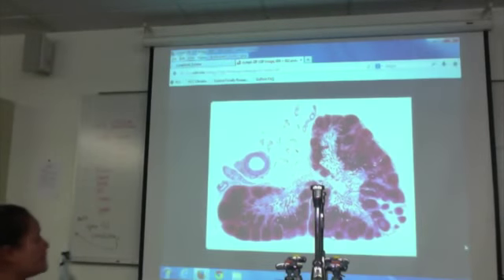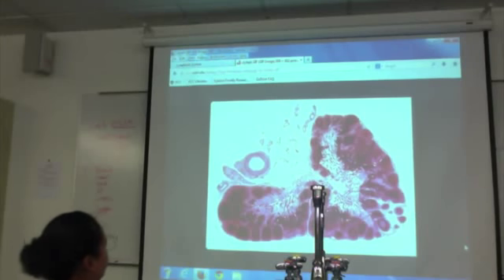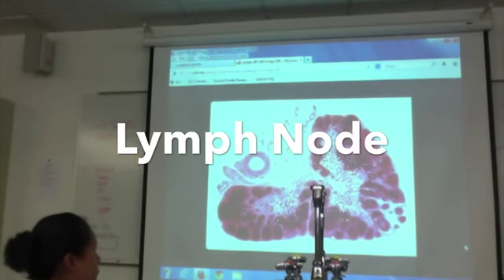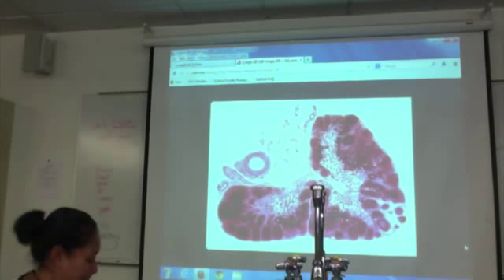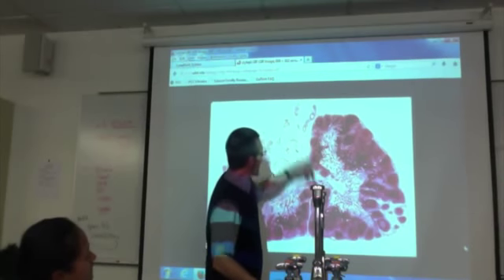Name the organ. I have votes for nodes. Yes. You sure? Bet you 75 points on it? You bet you will. Very good. How'd you know it's a lymph node? Circles on the edge. Well, there's one that isn't. Okay, that's fine.